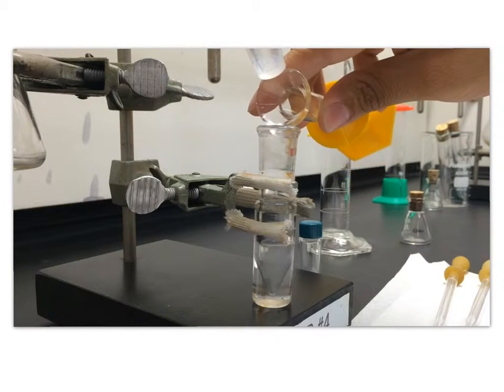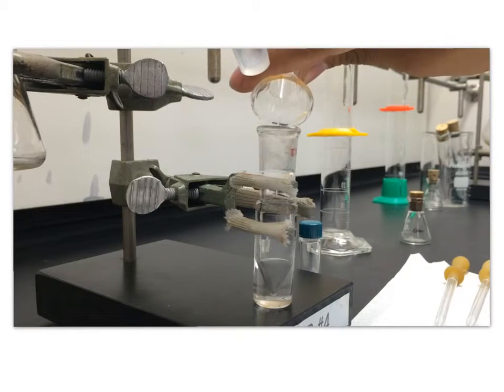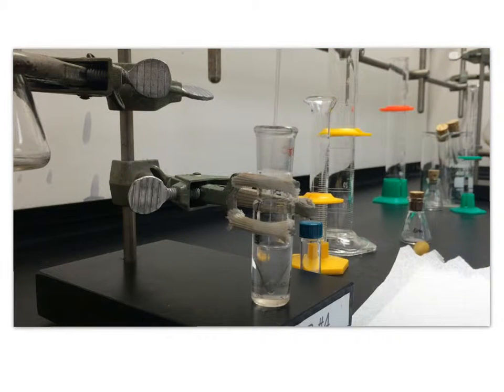There are a couple of theories being used for these extractions. One theory is one that we're all familiar with by now, which is that like dissolves like. So polar would dissolve polar and nonpolar would dissolve nonpolar. The substances that we were testing for were made out of organic or nonpolar parts, as well as a polar end.